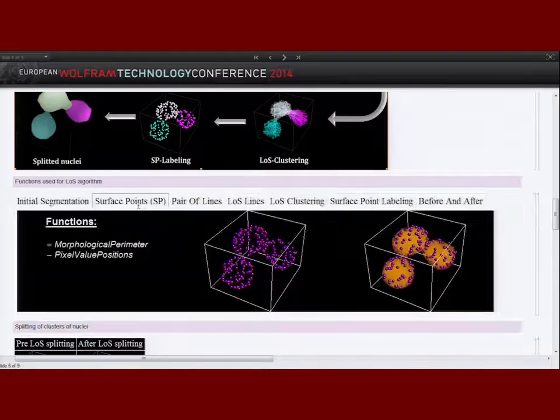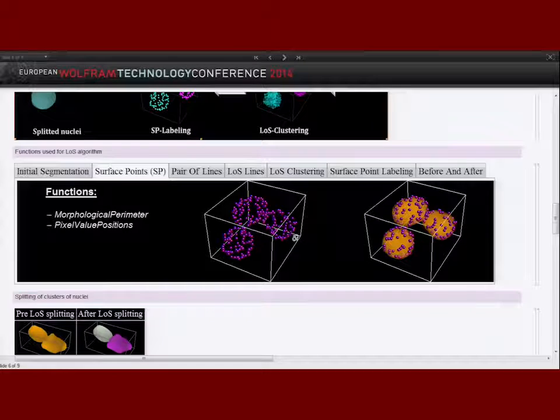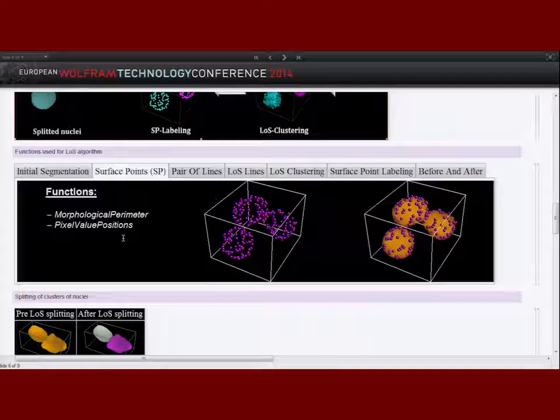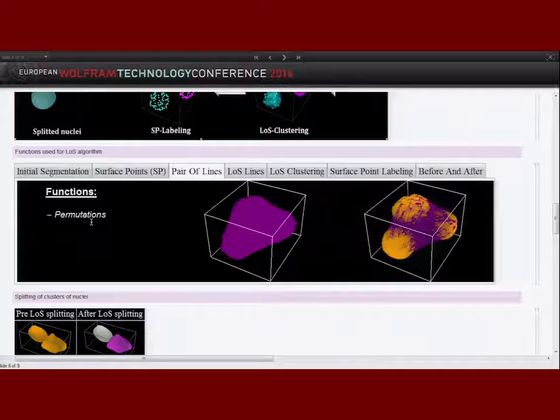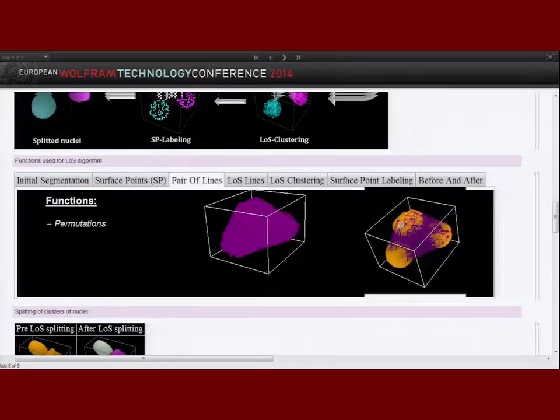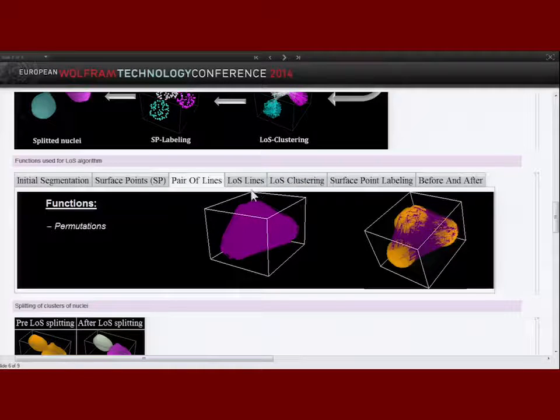The first step is to determine the surface points. This is done with the function MorphologicalPerimeter, which calculates the perimeter of the binarized object. I then use PixelValuePositions to get the positions of those perimeter values. Then I have to calculate the pairs of lines between each surface point, which is simply done with the function Permutations. Since I'm only interested in lines that do not leave the inner volume of the shape, I have to distinguish between lines of sight and those which are not.